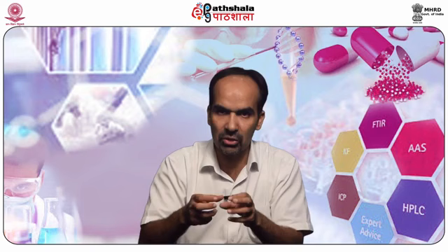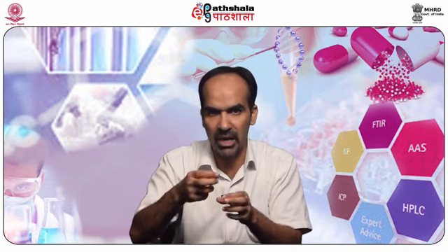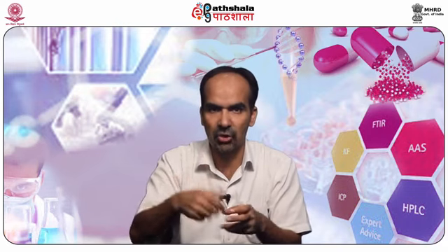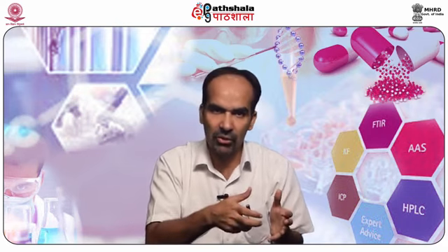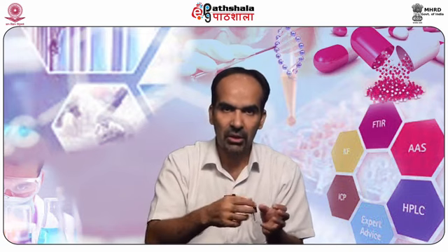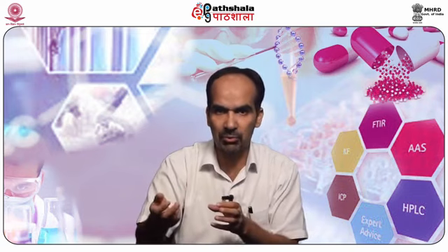Raise the unabsorbed portion of the oil into the neck of the flask by gradual addition of more alkaline solution, while rotating and tapping the flask to assist the separation of layers. Allow to stand for 24 hours and read the volume of unabsorbed oil using the lower meniscus. If an emulsion is formed which does not separate, repeat the experiment after the addition of 2 ml of xylene if needed.